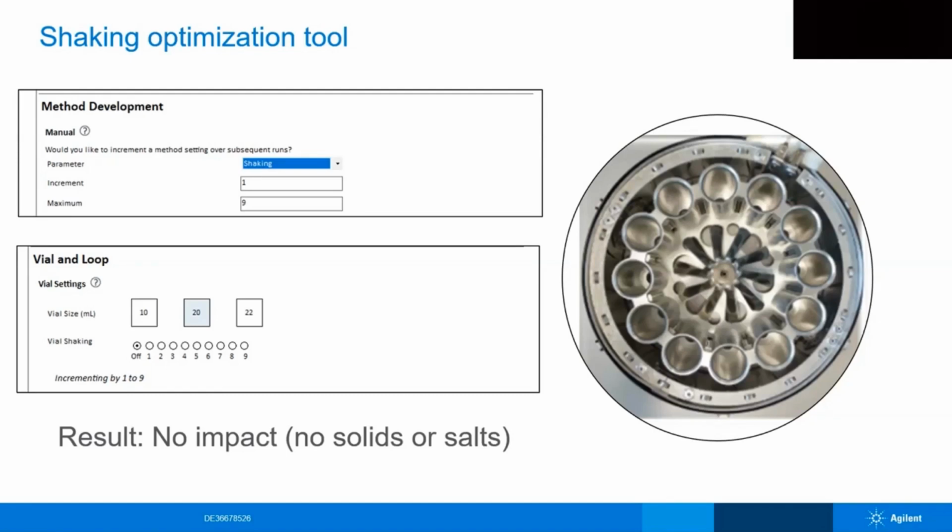And so this is a kind of a rotational shake. So this is almost like a very gentle vortex type of shaking movement, not an up and down or front to back kind of movement. So we're kind of trying to swirl and move things around inside the vial by agitating the oven.